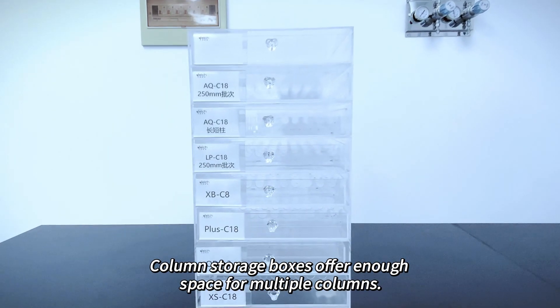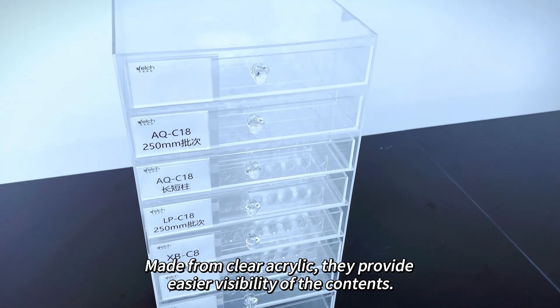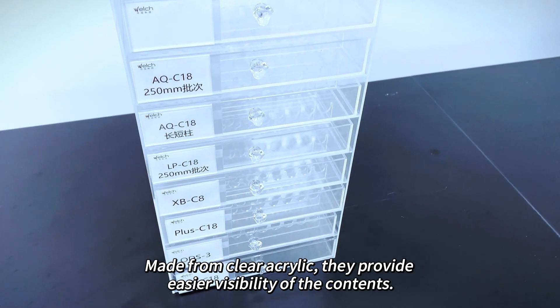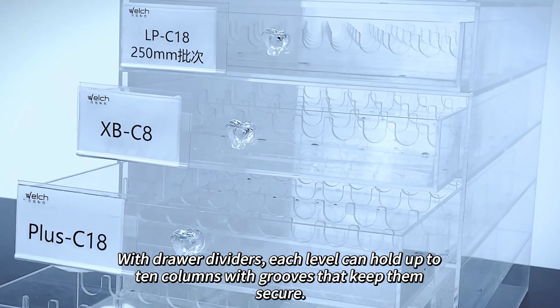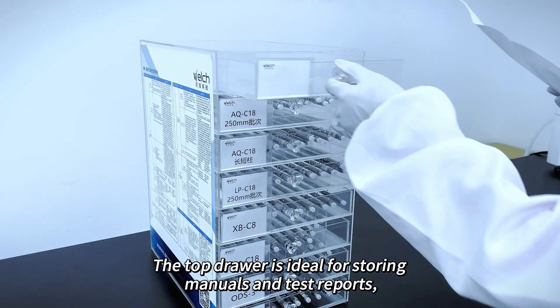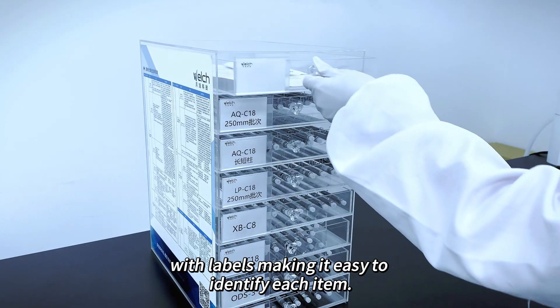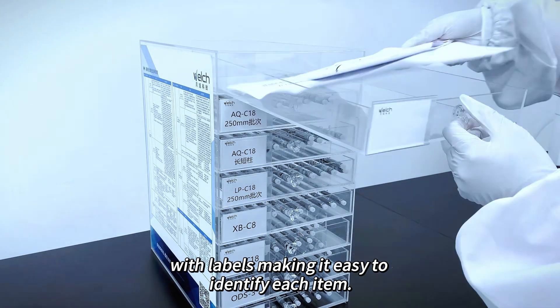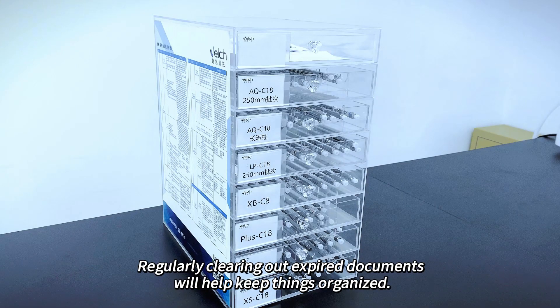Column storage boxes offer enough space for multiple columns. Made from clear acrylic, they provide easier visibility of the contents. With drawer dividers, each level can hold up to 10 columns with grooves that keep them secure. The top drawer is ideal for storing manuals and test reports, with labels making it easy to identify each item. Regularly clearing out expired documents will help keep things organized.